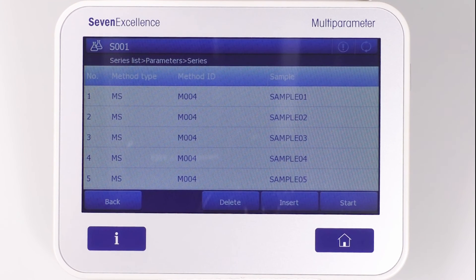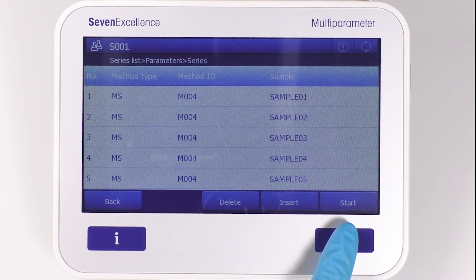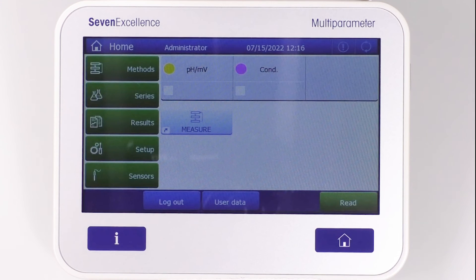Press the Home button to return to the home screen. Be sure to catch the final part of this series to explore direct measurement versus methods.